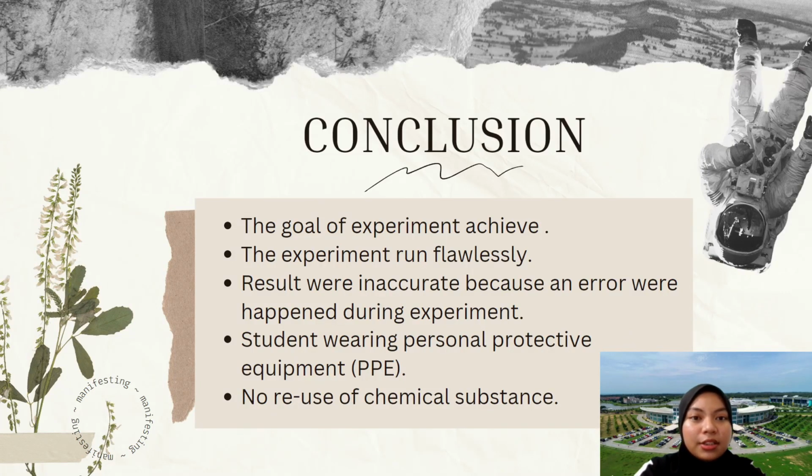In conclusion, the overall goal of the research, which was to expose students to and involve them in environmentally relevant health issues, was met. All of the samples were prepared flawlessly and the determination of formaldehyde in cigarette smoke went smoothly. As a result of an error during the experiment, the results were inaccurate.